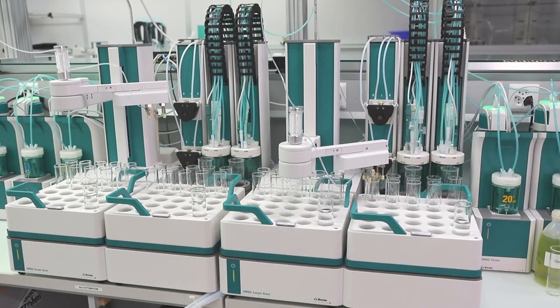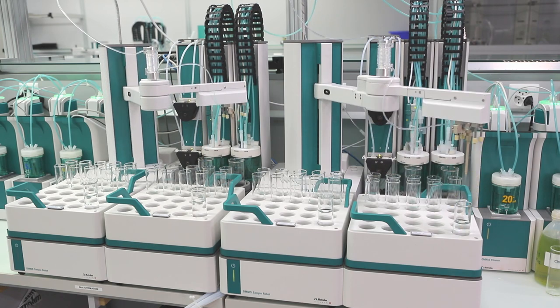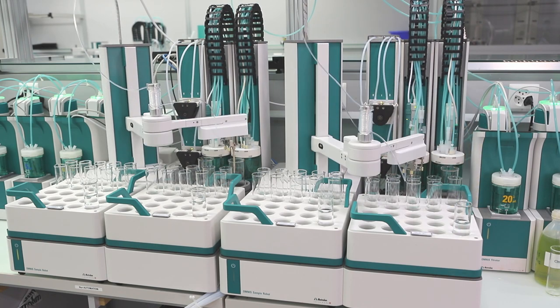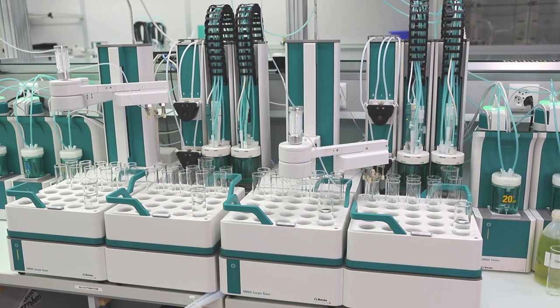The titrations are relatively fast whilst for the pipetting the aspiration and dosing speed is limited. The Omnis system can therefore be scaled up to four fully automated parallel titrations.